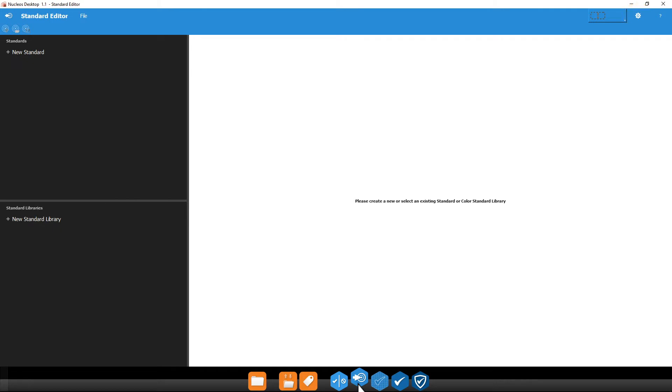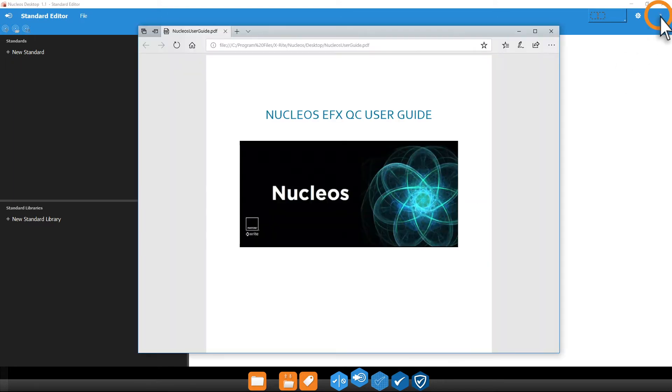Clicking this question mark will open a PDF of the detailed instruction manual. This is a great place to start if you're not sure what something does.